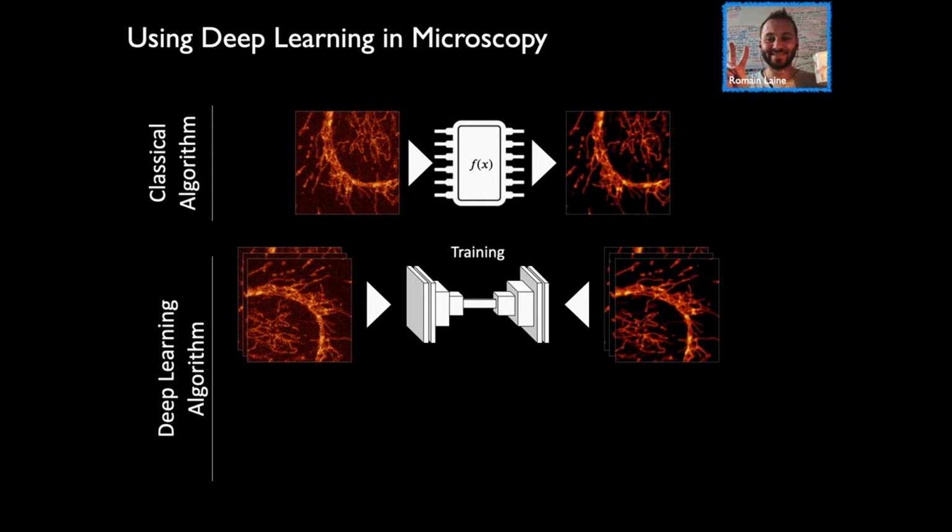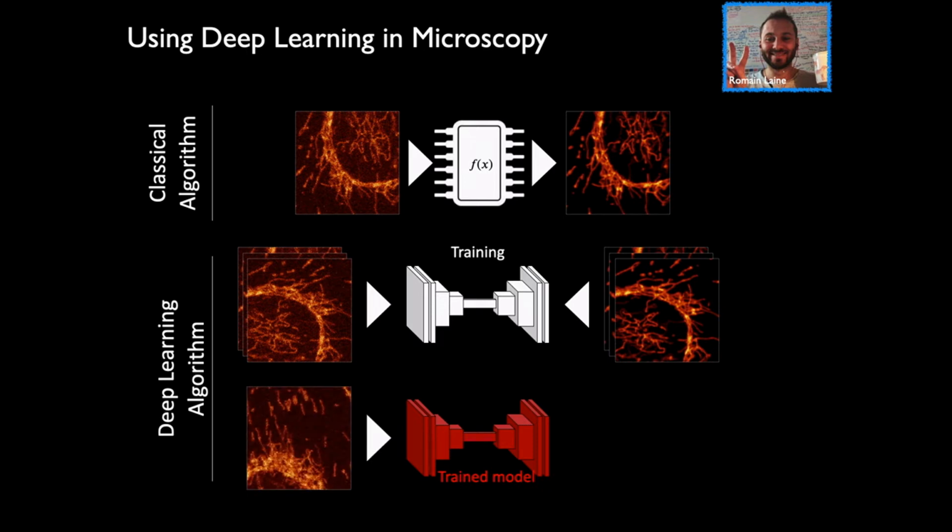So that means that the neural network goes through this optimization procedure where you show it a lot of data and it learns to its best capacity to transform the data that exists on the left to the data that exists on the right. The optimizer will converge, and at some point it will say, I can't converge anymore, therefore you have a trained network. And at that stage you can give it an input image and it will create a prediction which will be your output image, right?